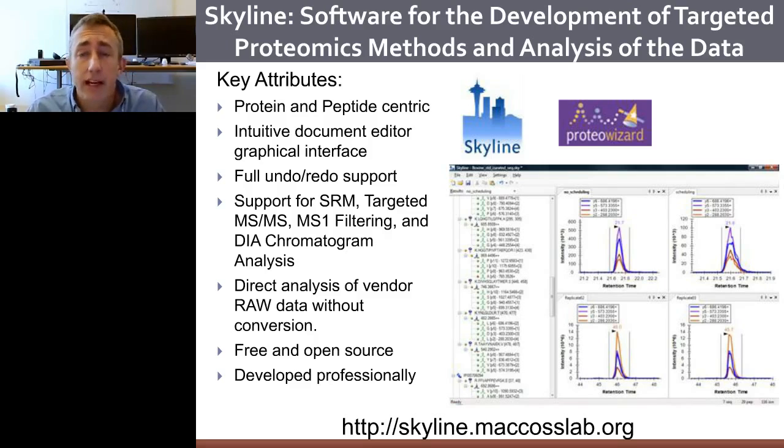We wanted it to be free and open source. Free because we wanted to do this as a service to the community. Open source because we wanted to make it completely available to people to check our code, to make sure that we were doing what we were saying we were doing, and we wanted it developed professionally.